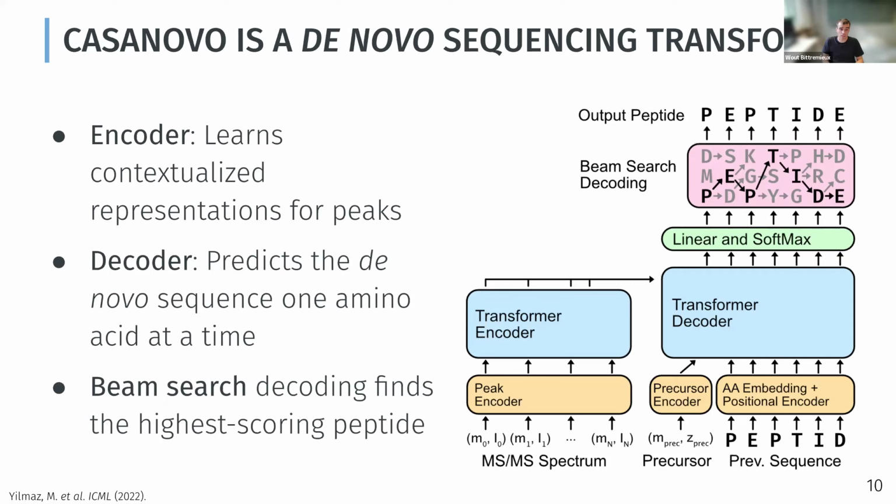Yeah, this is a good question, and it's actually an advantage or a strength of transformers compared to older deep learning approaches that, for example, used convolutional neural networks or just fully connected neural networks. Because older approaches used to represent spectra by just binning across the mass range and then using 1 Dalton bins and then assigning the peak intensities to the corresponding bins. This has several disadvantages.